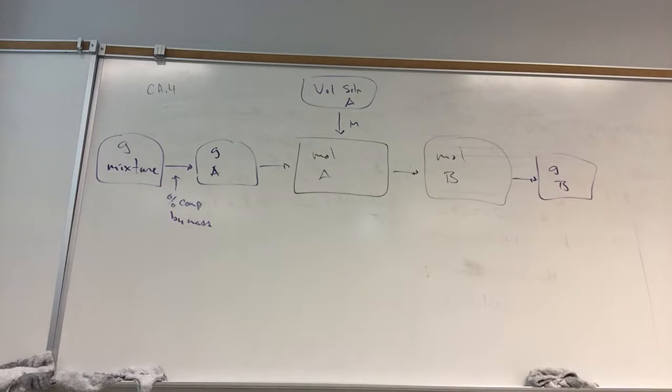You have some problems with solution dilution here, which is illustrated here. Just concentrated and then adding water to get the final. This is an MiVi, MfVf type problem. Okay, another solution dilution. Here they're showing the pipetting. You're going to have to do this pretty soon, actually. And so you want to use a pipette, either volumetric or more. Pipette the concentrated, dilute to the mark. The calculation is fairly straightforward.